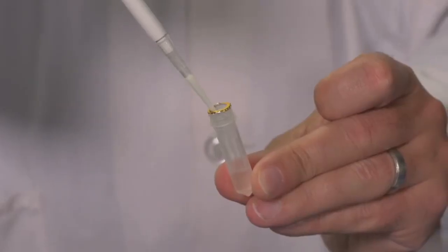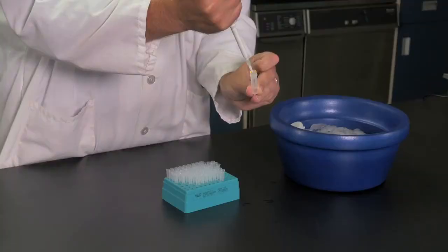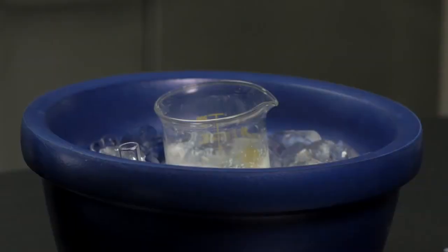To expel the milk, depress the plunger slowly and completely down to the second stop to dispense the entire sample. Eject the pipette tip after use. It's important to always use a new, clean pipette tip for pipetting samples.